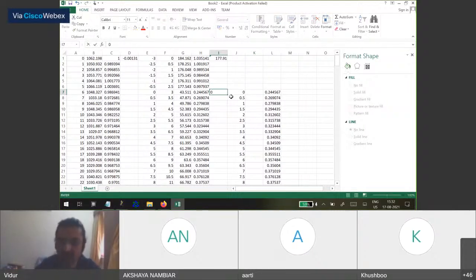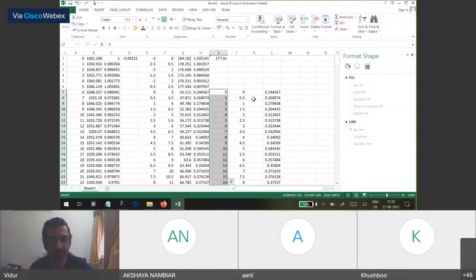which I forgot to tell you. You will have to make a time series which iterates with the row number. So you just put 0, 1, 2 and double click it so that it auto completes. This will be relevant later where we're correcting for the intensity. I'll show you why.